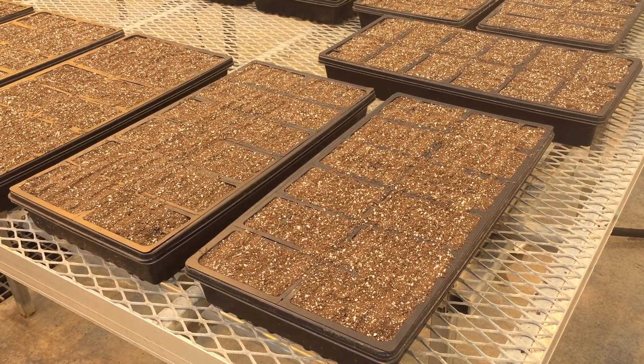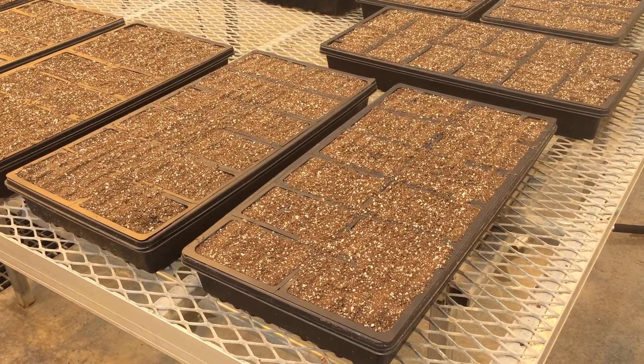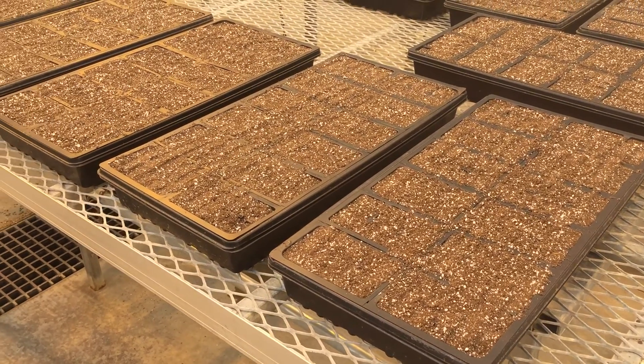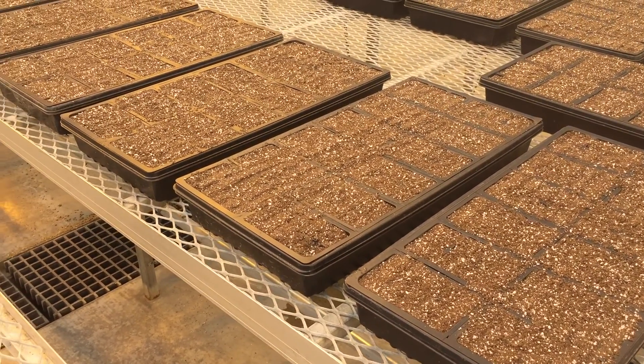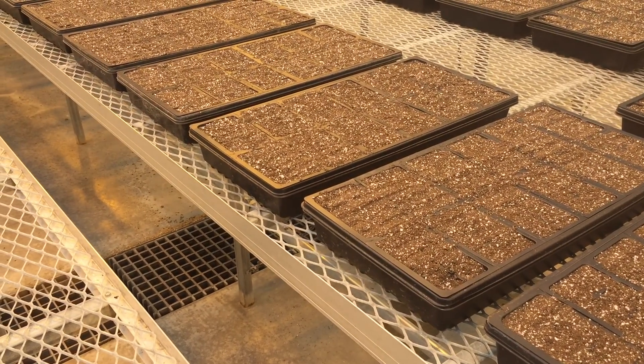To sow willow seeds, we plant them in Sunshine Mix No. 5 Seed Starter Mix, which we've used to fill 10 by 20 flats with 8 by 12 cell inserts.